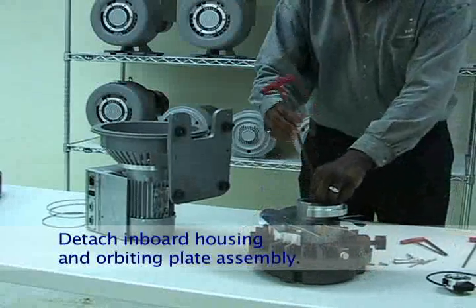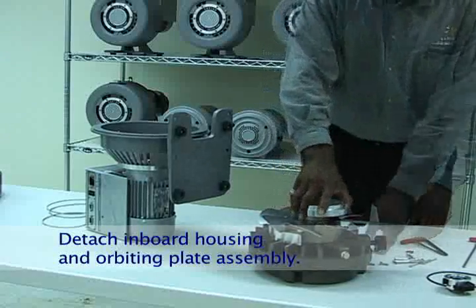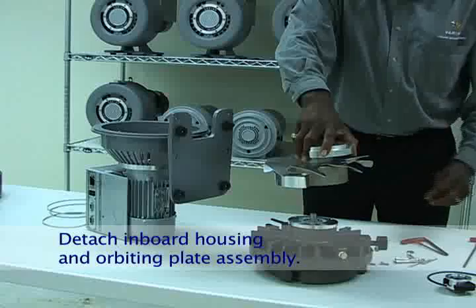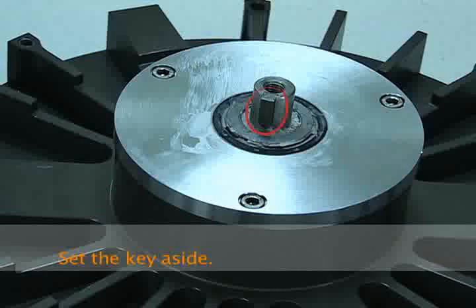Remove the M8 screw and washer that attach the fan assembly to the crankshaft, and then pull the fan assembly and counterweight from the shaft. Be careful not to lose the key from the crankshaft. Set the key aside.